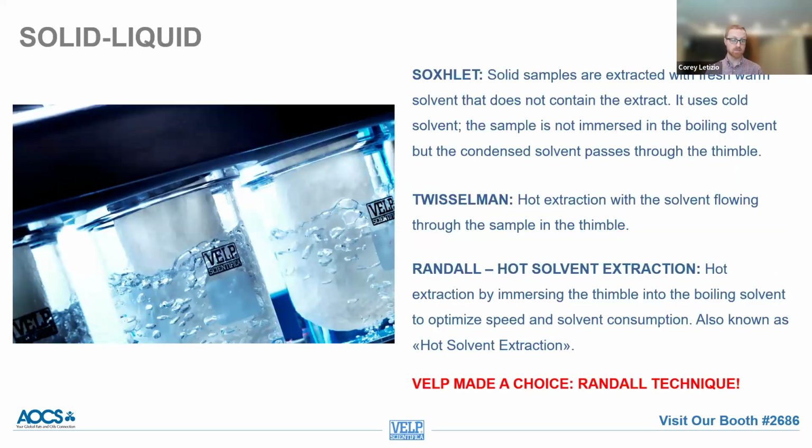Now, I'll talk a little bit specifically about the solid liquid extraction methods and the different methods that there are. We have Soxhlet, we have Twisselman, as well as Randall, which some people also call hot solvent extraction. Now, in the industry, these methods can be used interchangeably, but there are very important differences that I'd just like to review and make note of here.